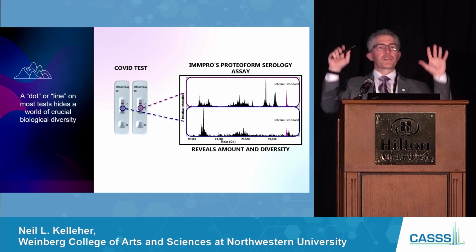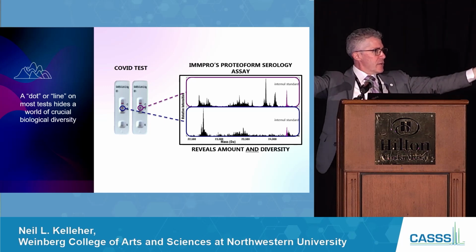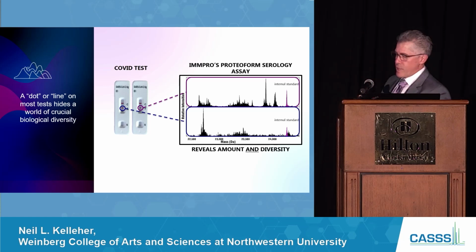This is just the light chain. This is after reduction, so this is not the intact IgGs. This is just the light chain after reduction. And that's an internal standard, so it's a clinical grade assay. It's a known sequence at 50 nanograms spiked in. And so there's your pattern.